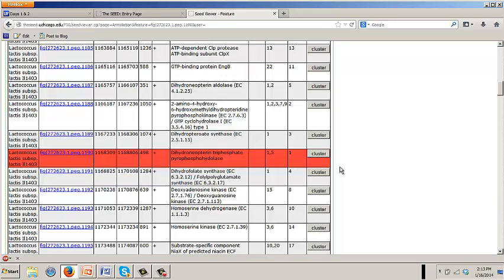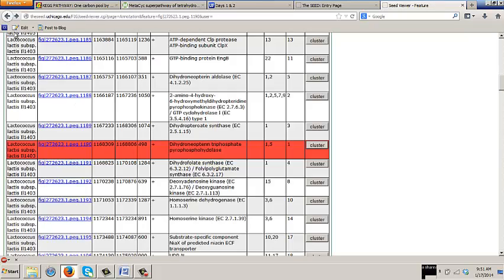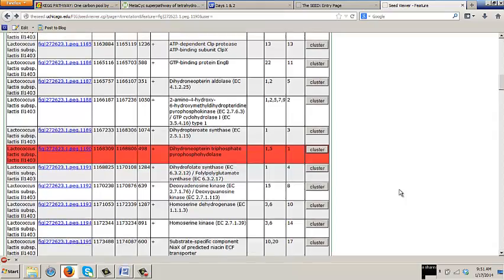Now, actually, if we click on this, it won't give us anything, or at least I don't think it gives us much. If we click on it for this gene, how do you interpret that? I always interpret that as not much. Yeah, that's not much. So we do that as an example of not much. But wait, there is something later on.